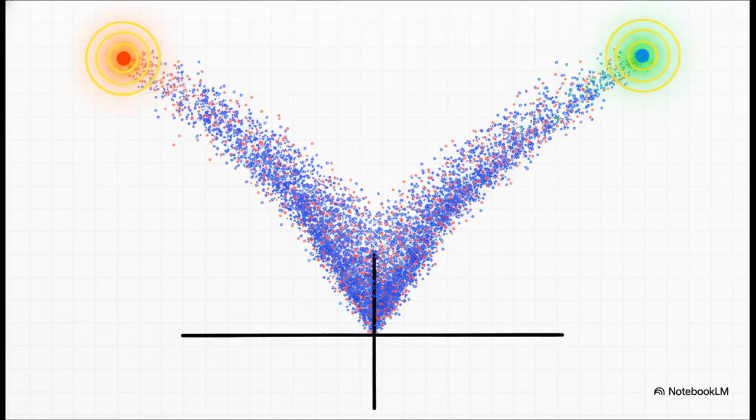Visually, it looks exactly like an eruption of dots. The highest dots shooting out to the far right and far left, those represent the genes that changed the most significantly between your healthy and diseased samples. Those specific dots are your prime biological targets.